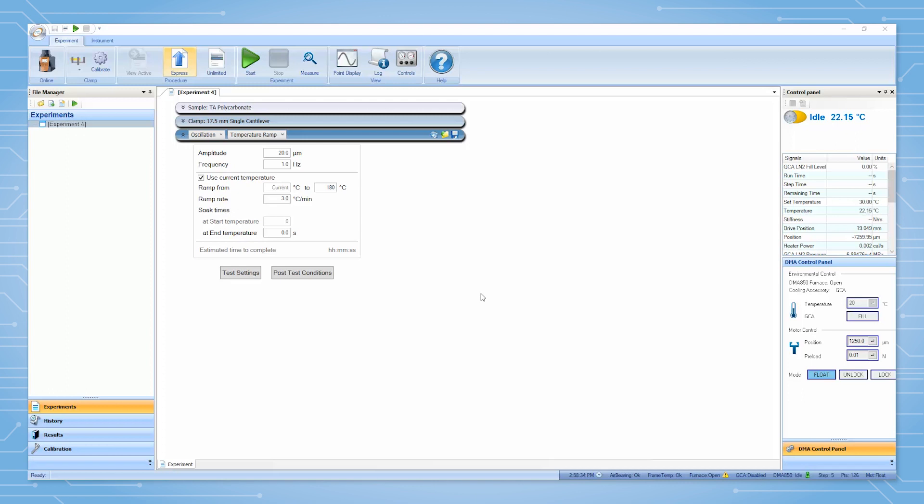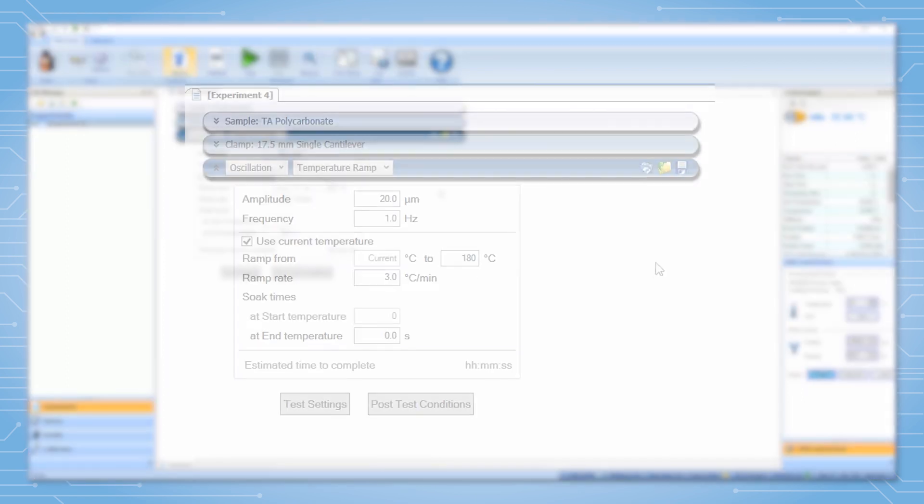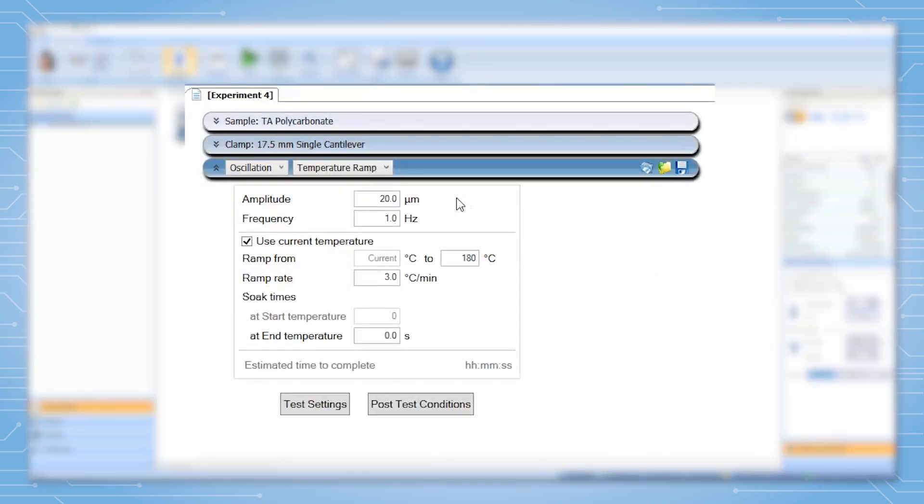Next we will set our test parameters for the temperature ramp. The first parameter to consider is the amplitude. Typically 20 microns is a good starting point for most clamps and most samples. The frequency will be set at one Hertz and is appropriate for most applications of this test.